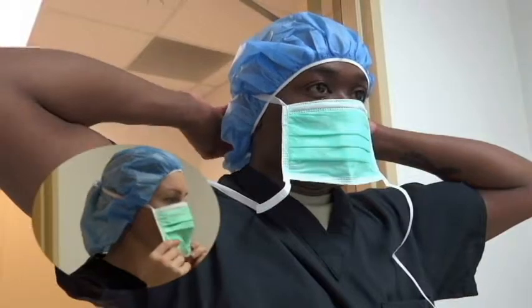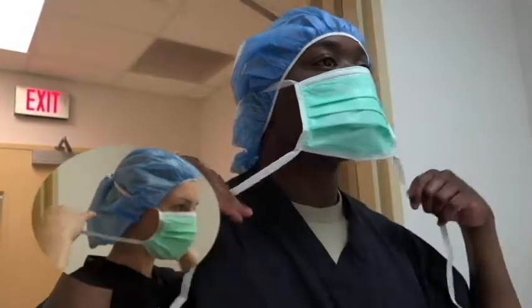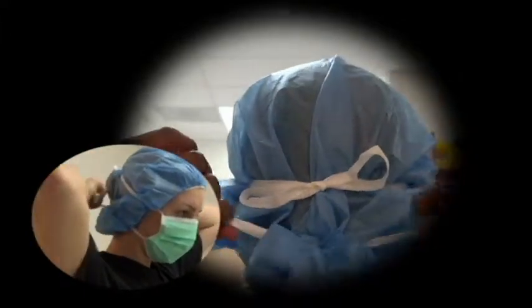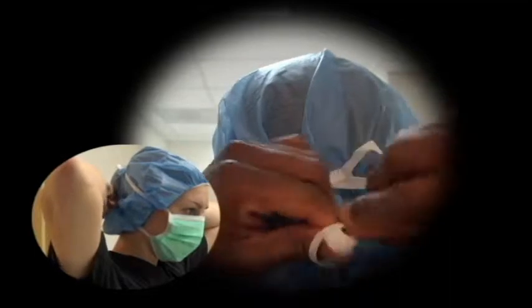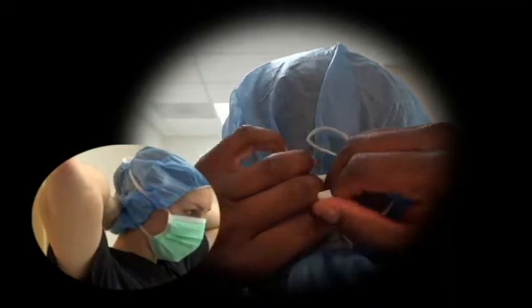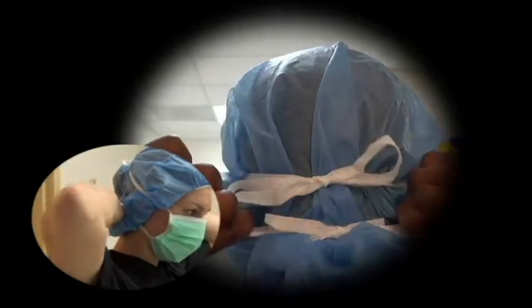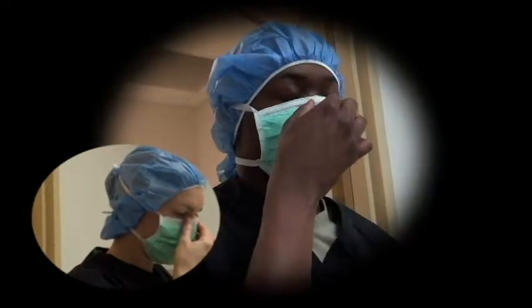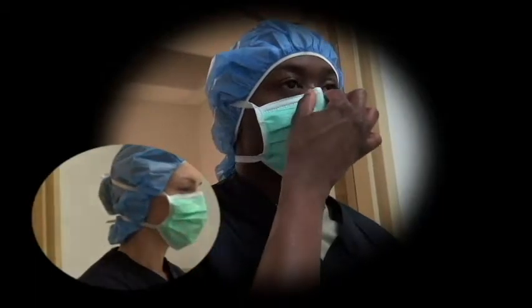Pull the bottom of your mask down to cover your chin and tie the bottom laces towards the lower back of your head. Make sure the laces are secured tight enough so it won't slide off your face. Pinch the flexible wire so it conforms with the bridge of your nose.